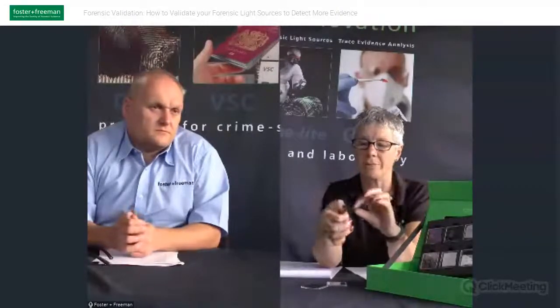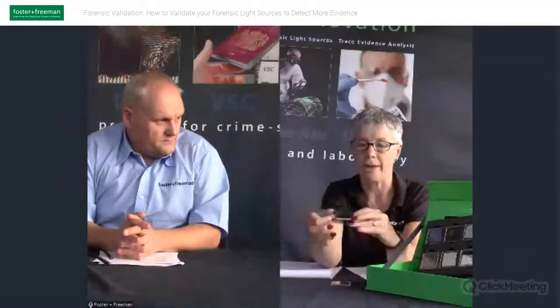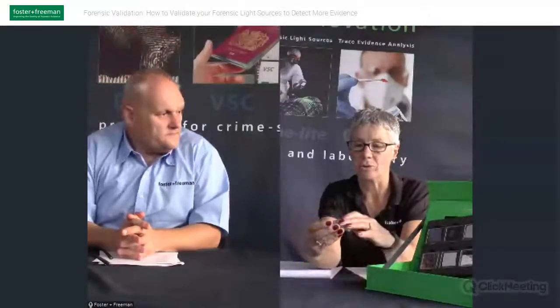So we've created a lovely contained fiber. You can see that is a thin piece of plastic with the sample name written on the back. So you can see there's a label, so that if it did come separate from the box, you'd be able to match it back. But it can be visualized very easily within that box.